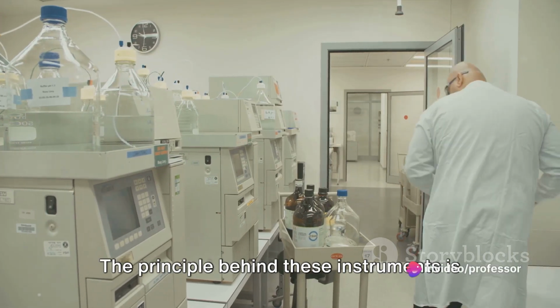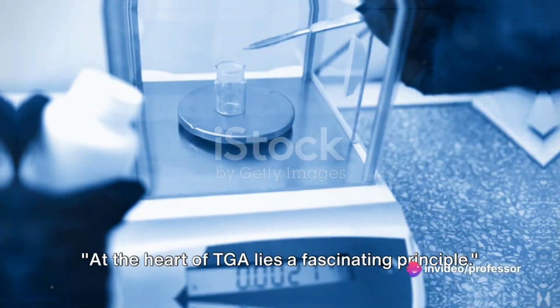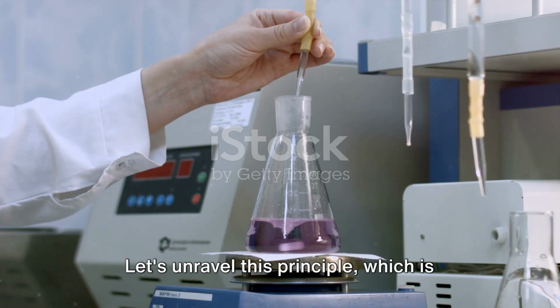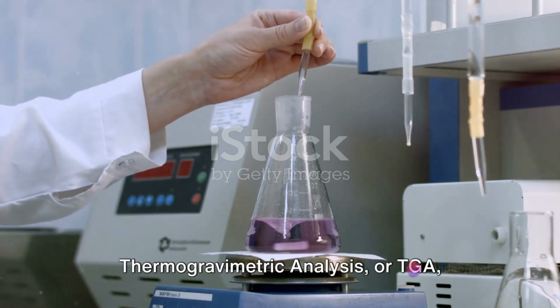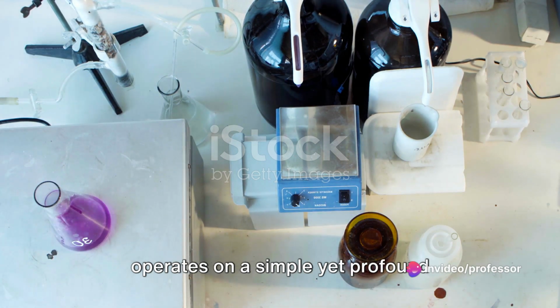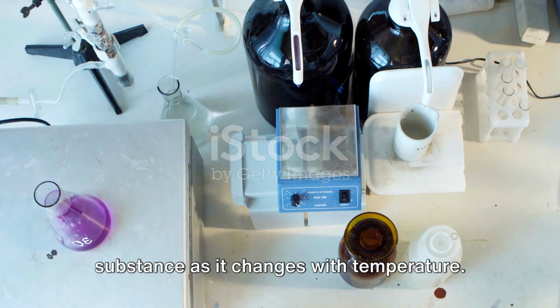The principle behind these instruments is just as intriguing as the instruments themselves. At the heart of TGA lies a fascinating principle. Let's unravel this principle, which is nothing short of a marvel in scientific exploration. Thermogravimetric analysis, or TGA, operates on a simple yet profound principle. It measures the mass of a substance as it changes with temperature.